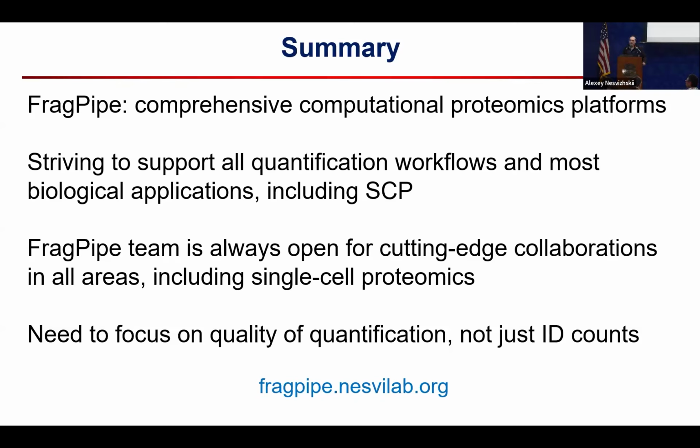Sorry, one more question. Today, Ryan talked about very fast gradients, like 0.5, different kinds of short gradients. So in the DIA computation, for these different gradients, do you think the spectral library can be universal? By using reference peptides like iRT for calibration, is that robust enough? Well, I think it's a really complicated question. I'm not able to give an answer in 5 seconds.